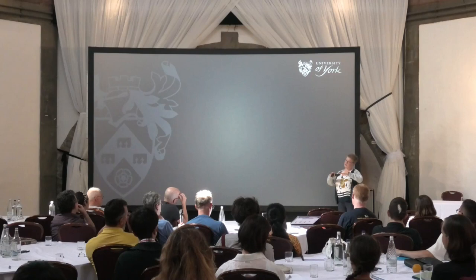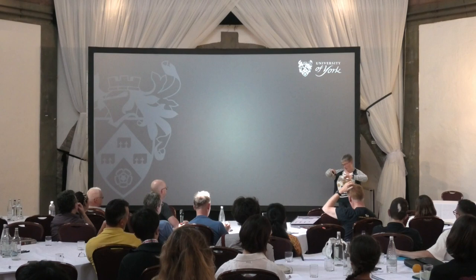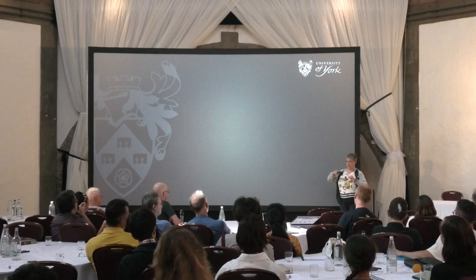So I asked Tibor to look particularly at the tomograms to see if you see any evidence for protein in those sort of gappy areas, and it really looks like there is actually a gap. But the membrane is there.